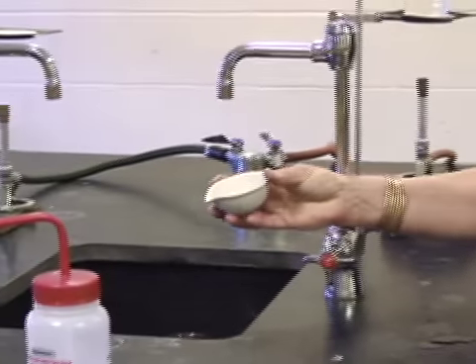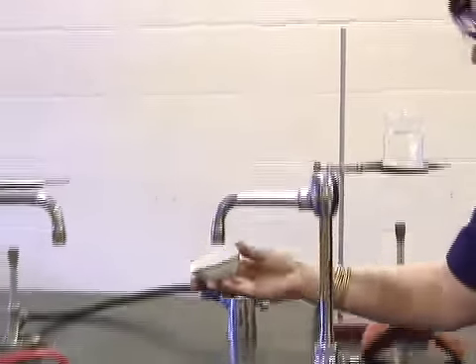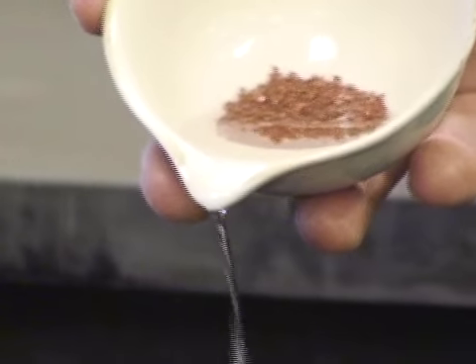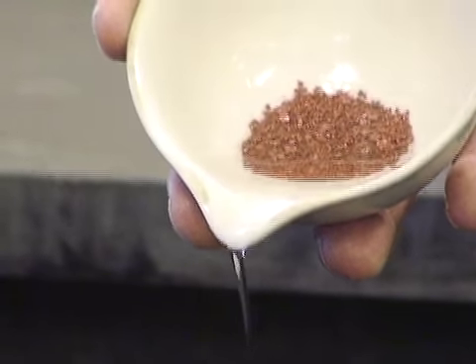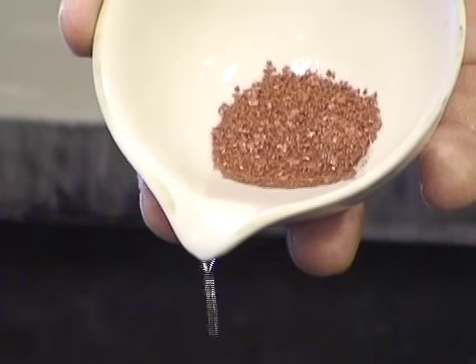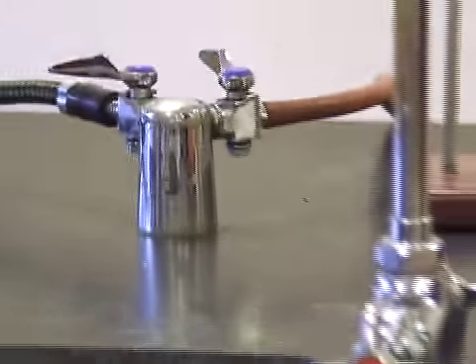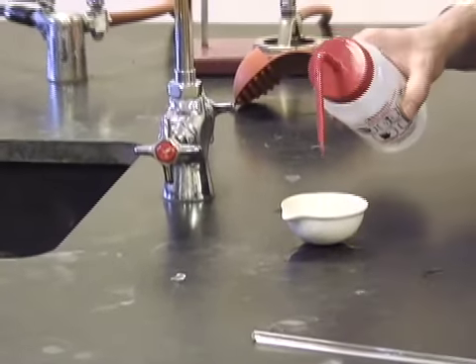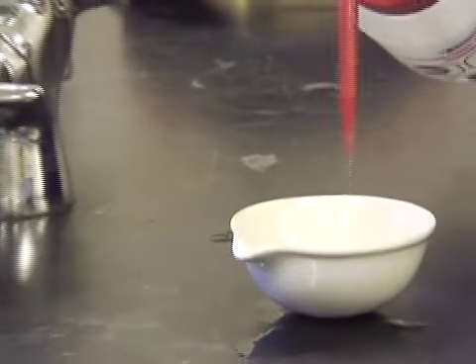Now I have poured some methanol onto my precipitate, and I'm going to decant that as well. And sometimes there's copper that comes out here. I'd have to be very cautious and try to pour off as much as possible. Now I'm going to add the acetone, and it calls for 5 milliliters, but I'm going to give it a good squirt.